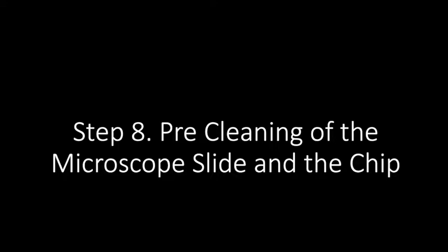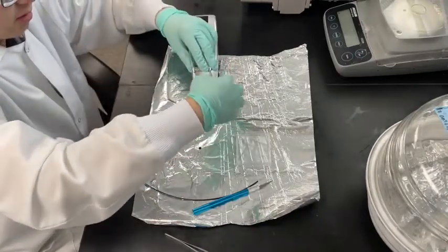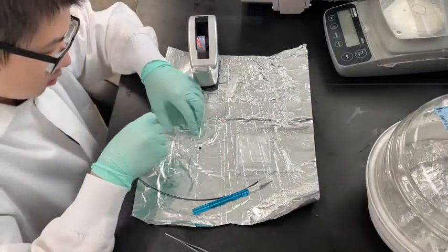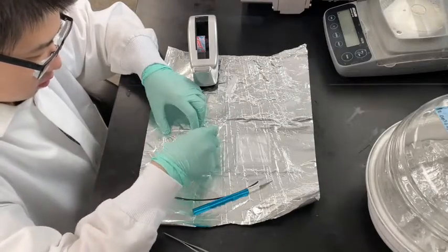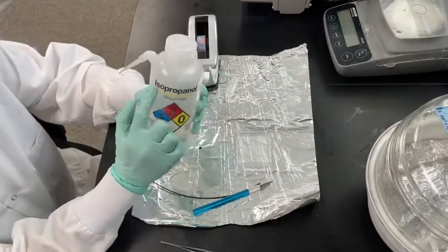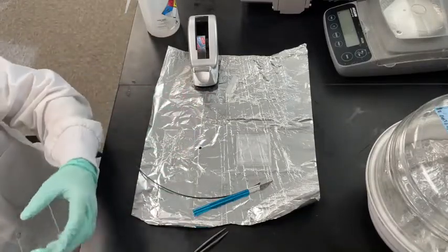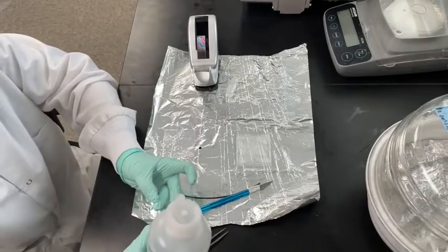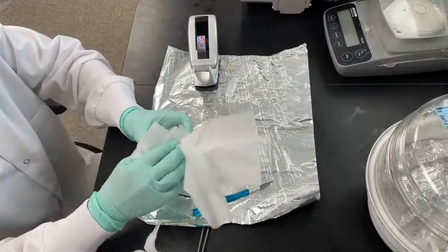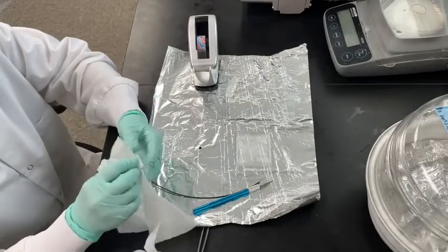Next, the PDMS chip will be bonded to a microscope slide for use. First, ensure the chip and microscope slide are clean. In a normal lab environment, you can do this by using scotch tape to remove dust particles. Press the scotch tape along the top of the PDMS chip and then remove to clean the surface. There should ideally be no dust on the face that will be bonded with the channels. For the microscope slide, use isopropyl alcohol to apply a thin layer on the slide, then use a chem wipe to dry and clean the surface. The slide should be dry before proceeding; after wiping, the alcohol should dry within about 10 seconds.